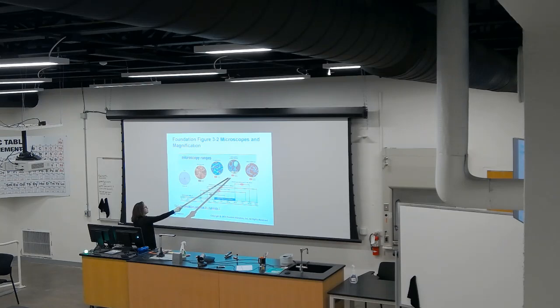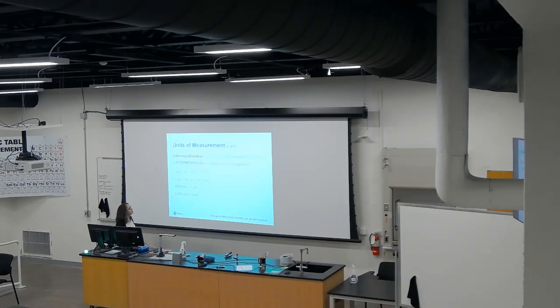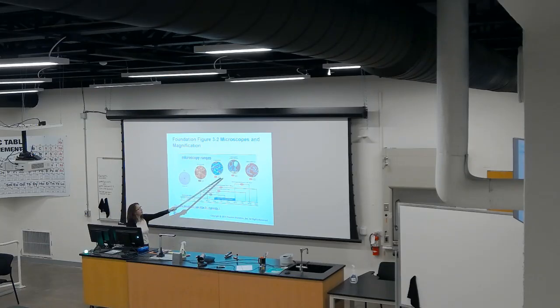With TEM, you have here visualization of an actual virus that can infect E. coli, T-even bacteriophage. This one looks like a little alien ship. It has this pin that can connect to the surface of the bacteria and inject the DNA to infect it.